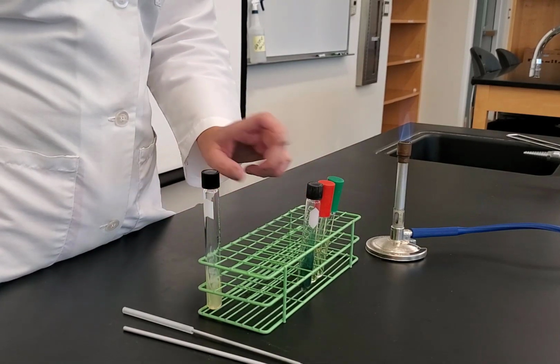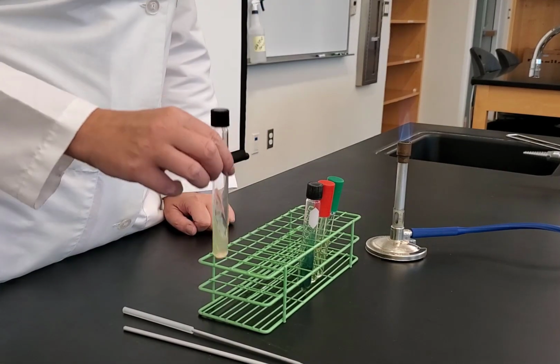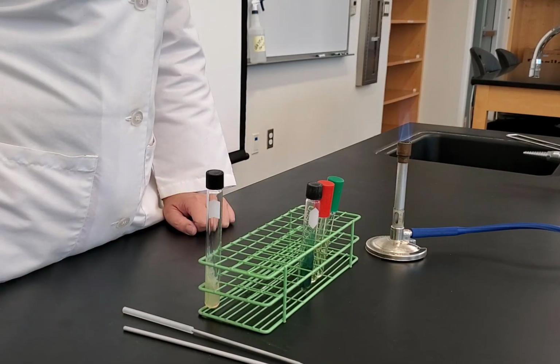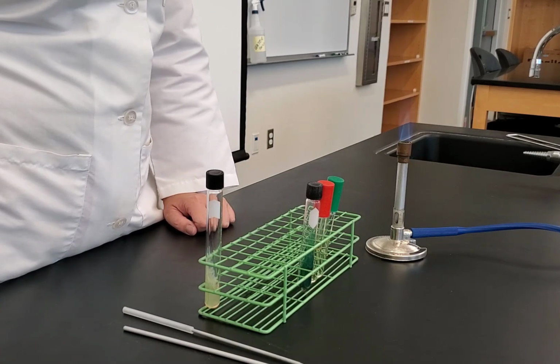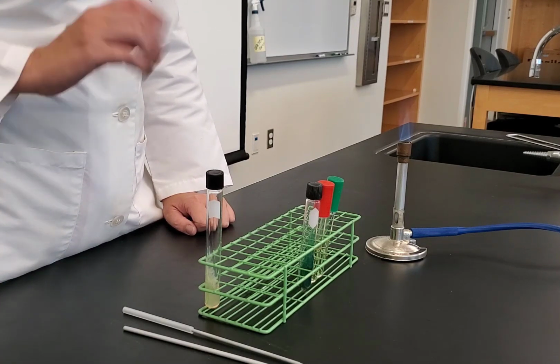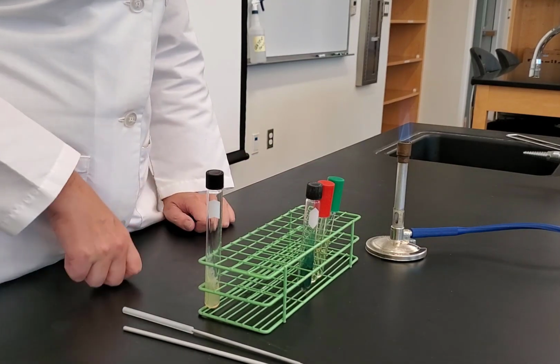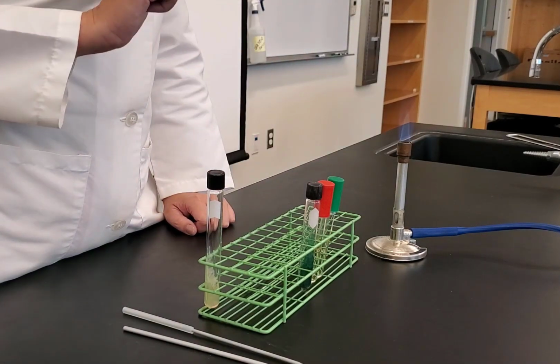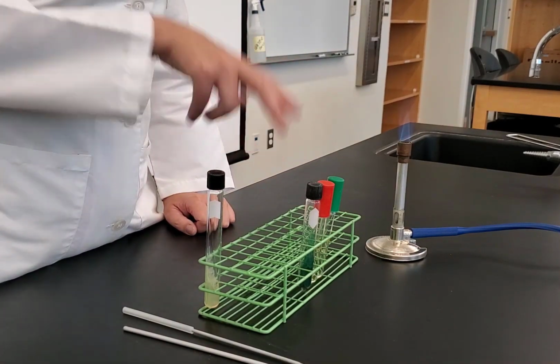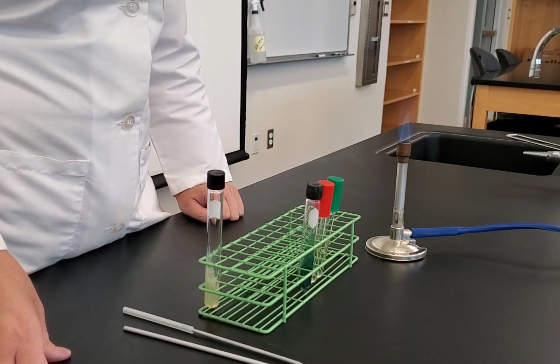So we would have 3 tubes that have E. coli. This is our E. coli that we're using. We would also have 3 tubes that have our Enterobacter aerogenes, which is our other organism that we're testing. Again, for the purpose of this, I'm just going to demonstrate setting up 1 set of tubes, meaning just for 1 organism. But then you have to imagine that there's going to be 2 sets. So you would have in your rack, if you were doing this, 6 tubes total.